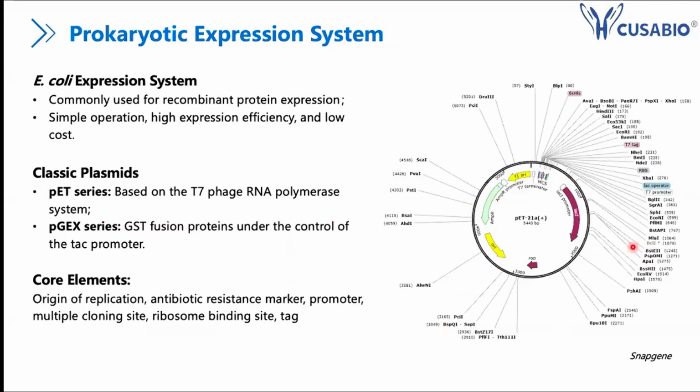So, a very brief introduction to the prokaryotic expression system. To be simple, the commonly used one is the E. coli expression system, because it is very easy to operate, the expression efficiency can be high, and it is also low cost, meaning that this system is cheaper than all the others. And because long ago, people already developed different plasmids for this one, there are already some classic plasmids on the market for researchers to choose.